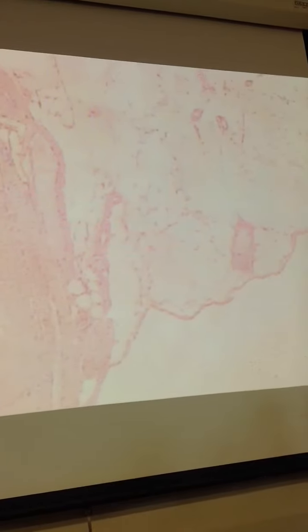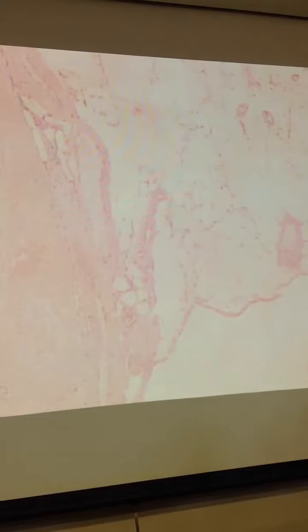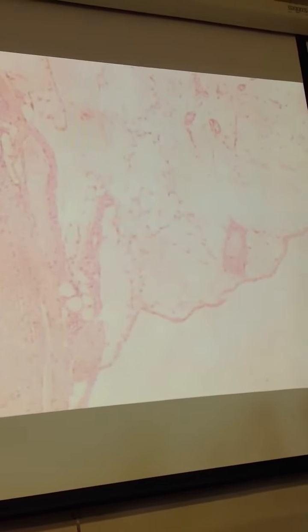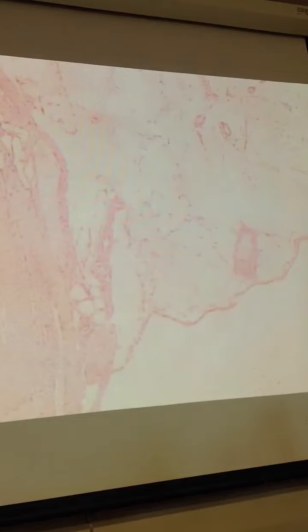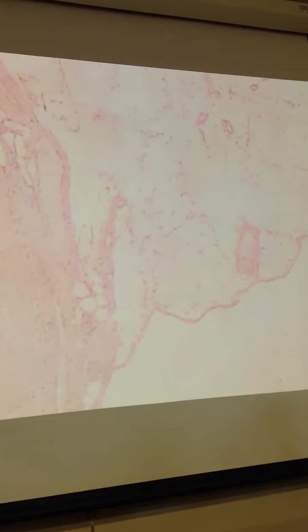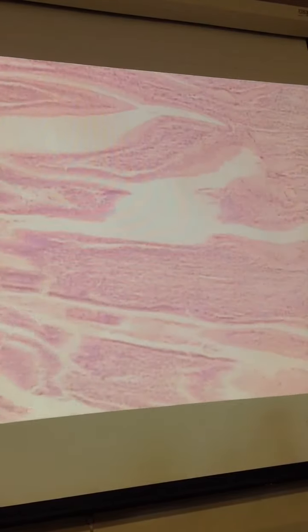Alright, there we go. So serosa again, remember it's just going to be connective tissue. After the muscle, here's the muscle, here's our serosa. Right? Now for the duodenum, there are 3 things you need to be able to identify. The first 2, the villi and the intestinal crypts and glands, those are going to be both found in here.